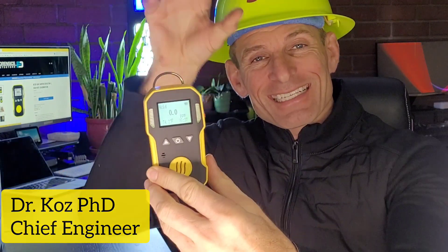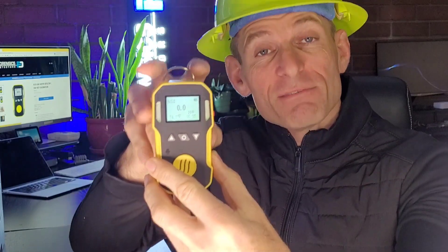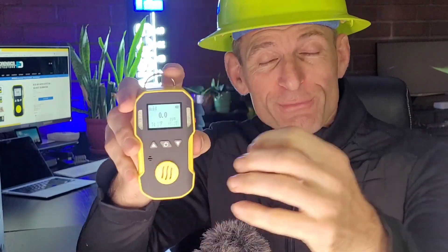Welcome to Forensic Detectors, I am Dr. Koz, your gas meter, gas detector. Today we are introducing our acid gas detector, our acid vapor detector — perfect for folks working with liquid acids in manufacturing, in research and development, in chemical processing, and many other industries.